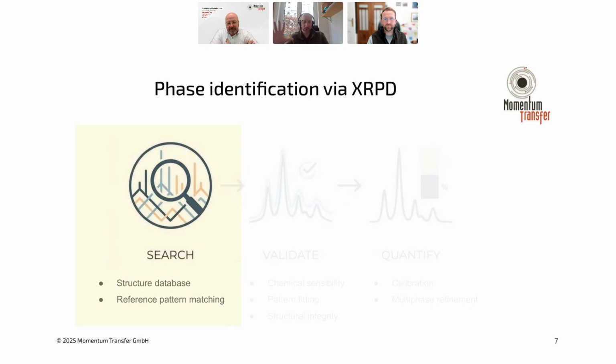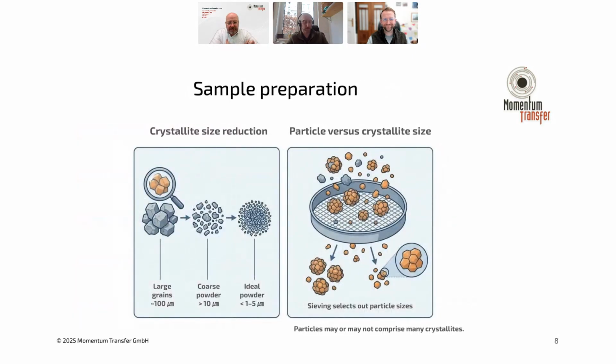So today we're just talking about how to find candidates, and that's what our tool does. But I want to take a step back, again for the newcomers, new practitioners who want to get into doing this more, to make sure there's enough focus on sample preparation, which is really important if you want to get the best quality data out of a good instrument and have the most chance of successful analysis. You have to have good sample preparation.